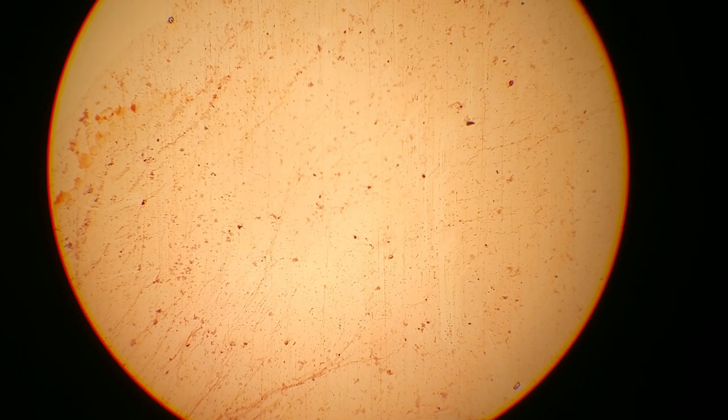Here's the saffranin stain sample at 100x. As you can tell, it's not high enough of a magnification to really see what's going on. If we go up to 400x, we can start to see some cell shapes, but what we really need when we're working with samples like this is a full 1000x magnification.